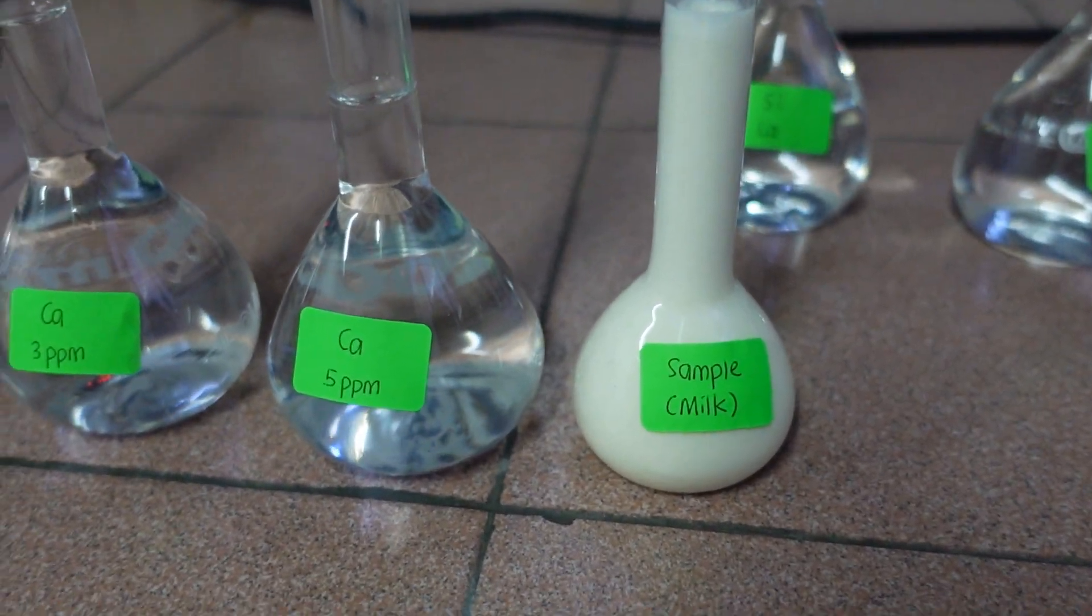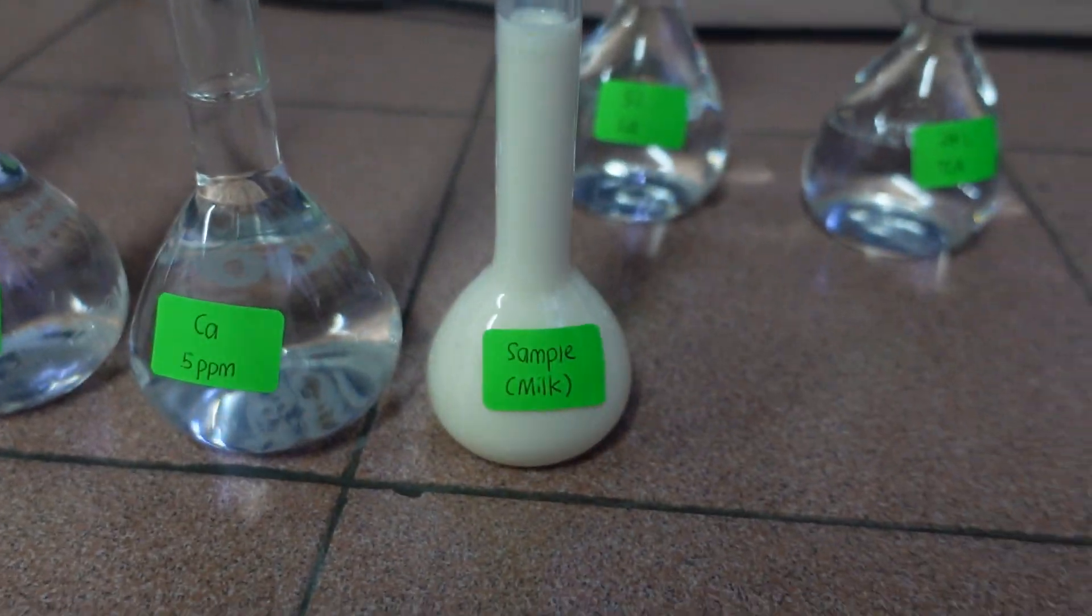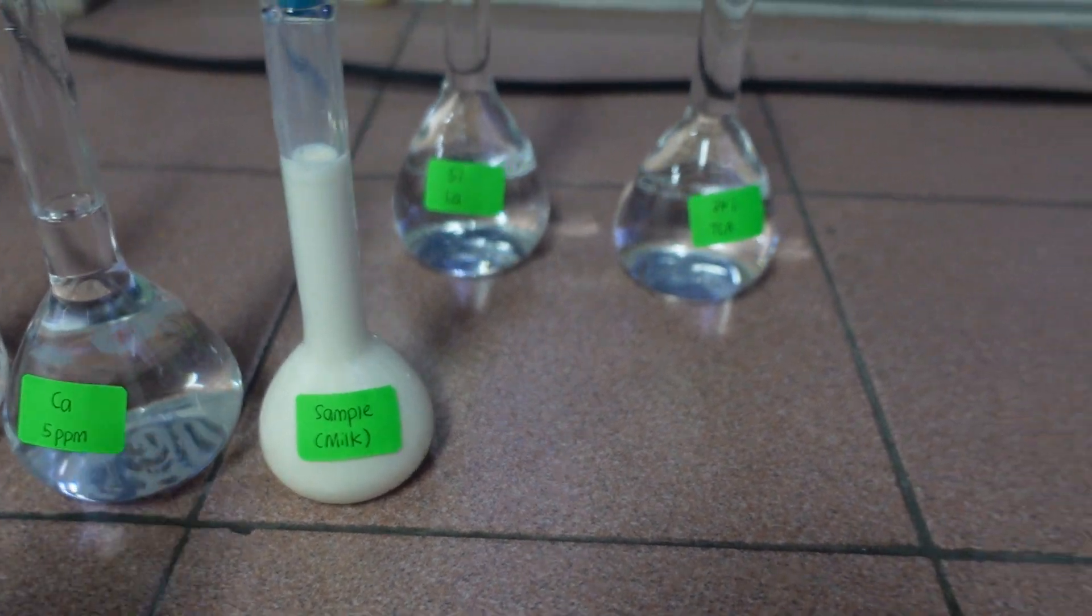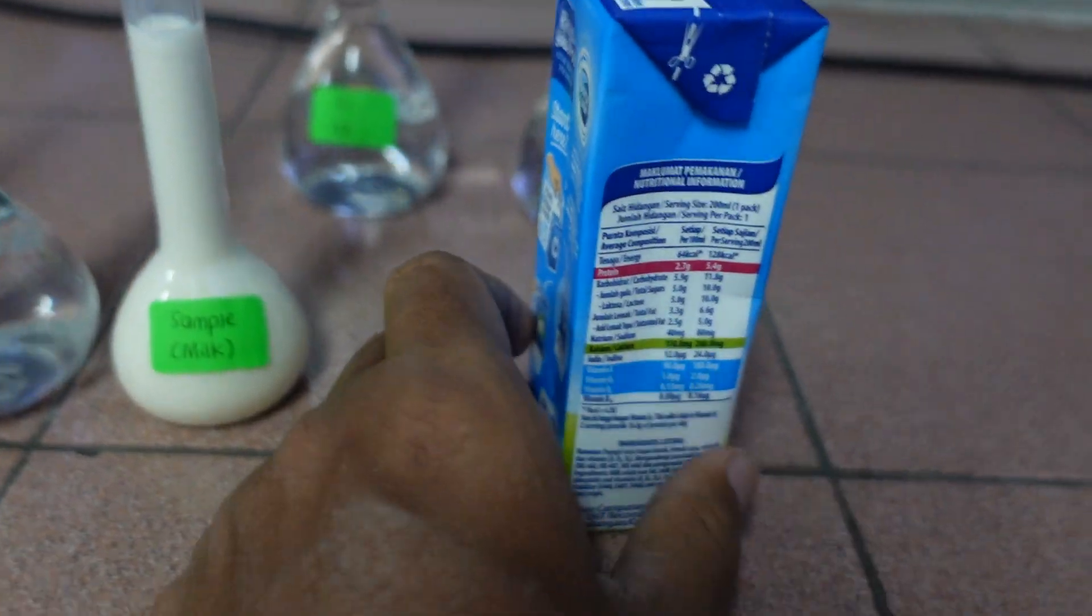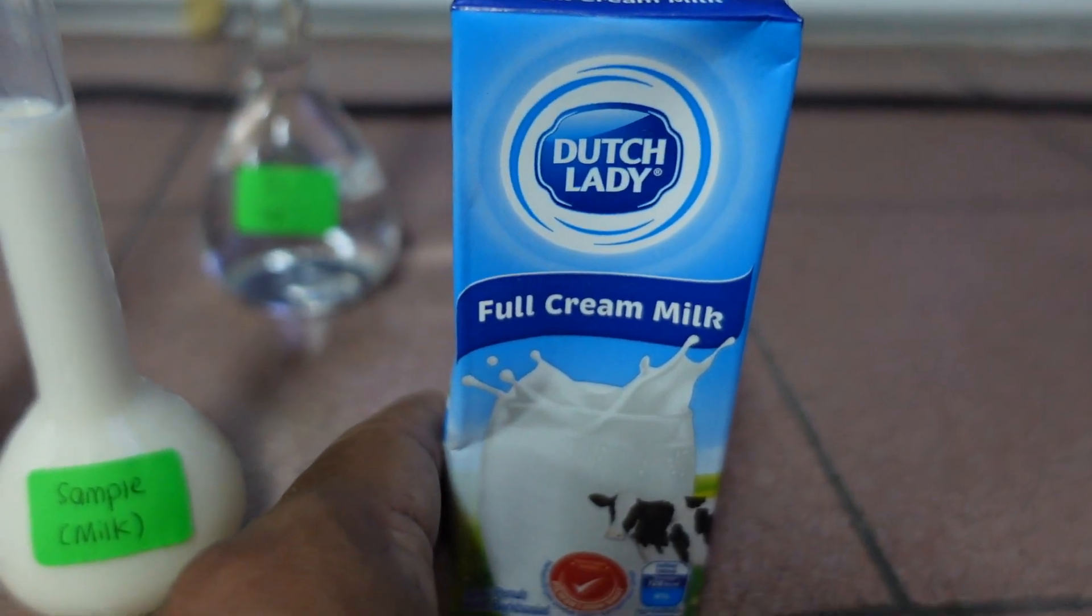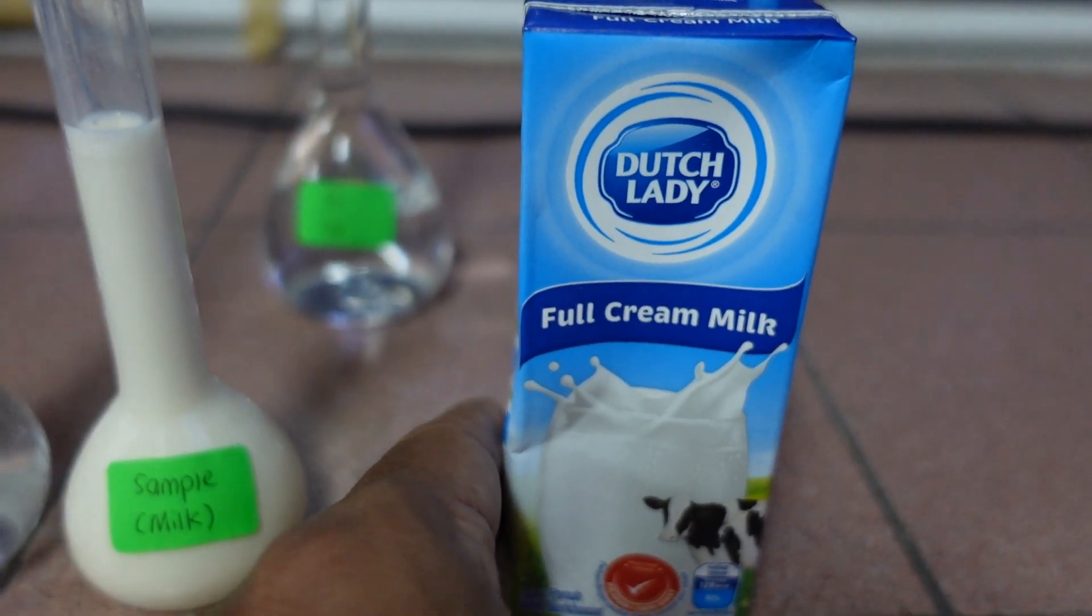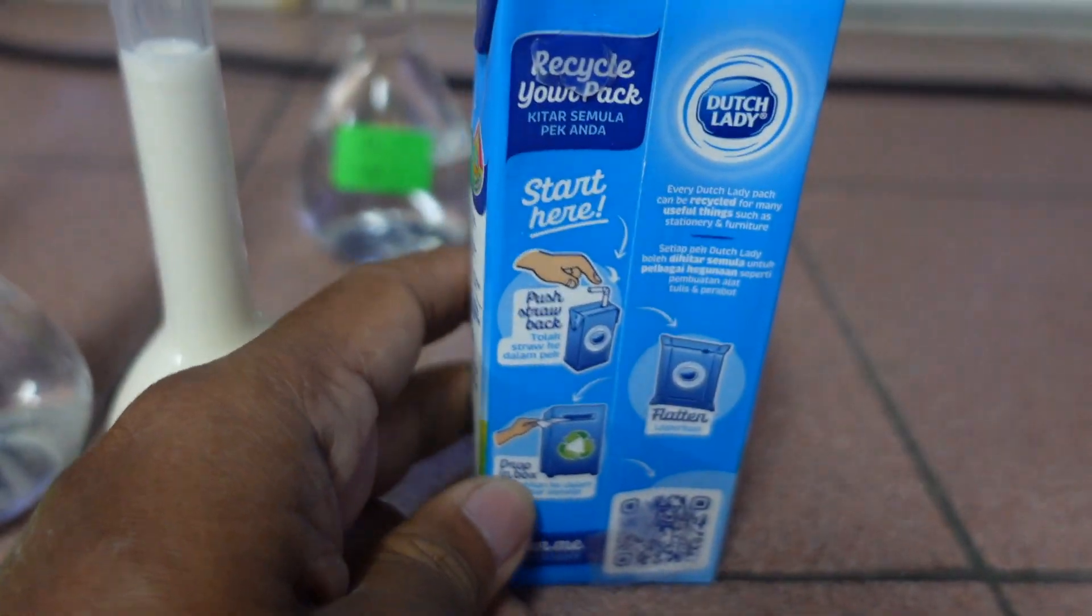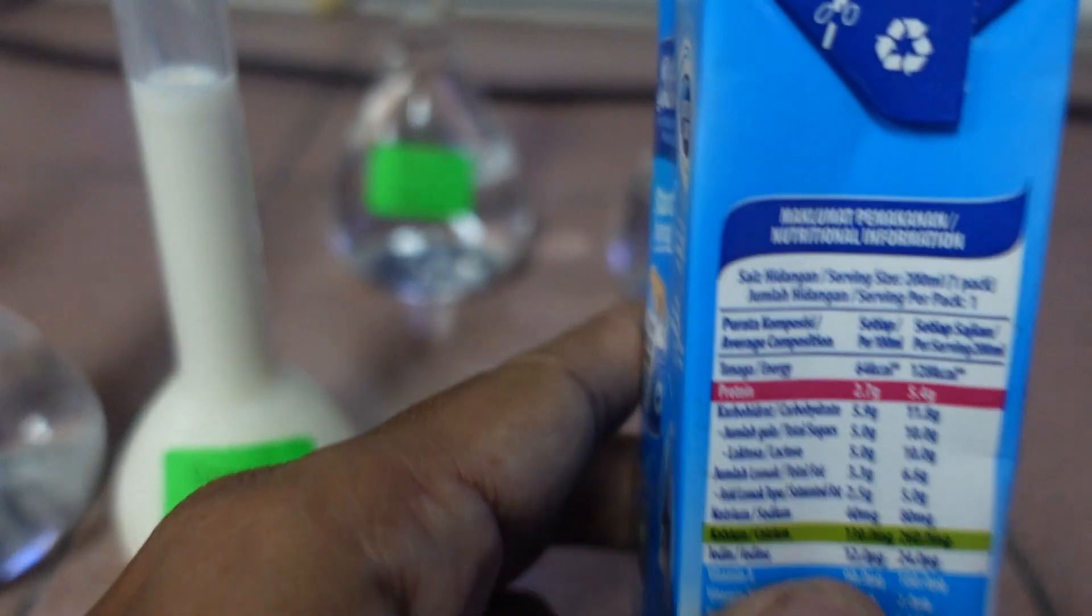This is our sample. Some samples we need to do dilution. For today, we are going to do this sample as is, and also we are going to do another dilution. I got a sample from Dutch Lady, full cream milk. For reference later, you might want to refer at the label of the bag to see the amount of calcium.